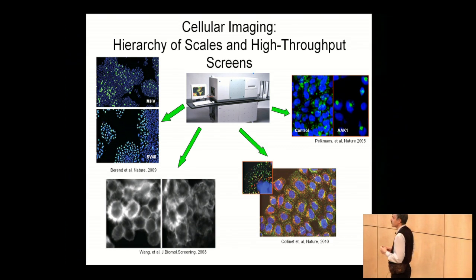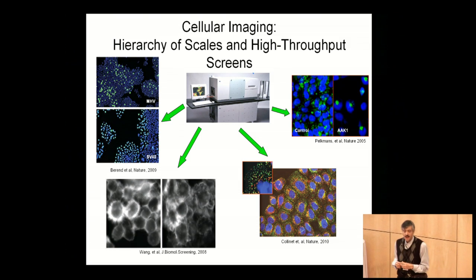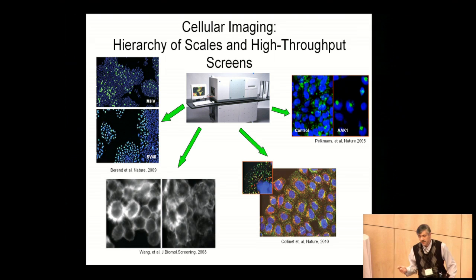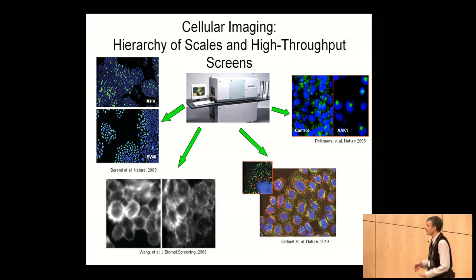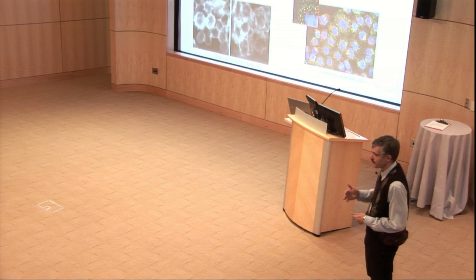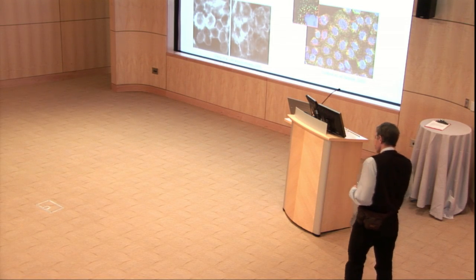Another problem when we have to go to a more quantitative way is high-throughput microscopy, which now becomes a really big deal. When you have something like an automatic microscope, it's easy to generate millions of images in one experiment. So what will you do with these millions of images? Even with 10,000, you can't look through them. Okay, maybe you can spend half a year looking through them, but on the next day you won't remember what you looked at the day before. So it's absolutely unfeasible. You have to somehow quantify it and extract information.